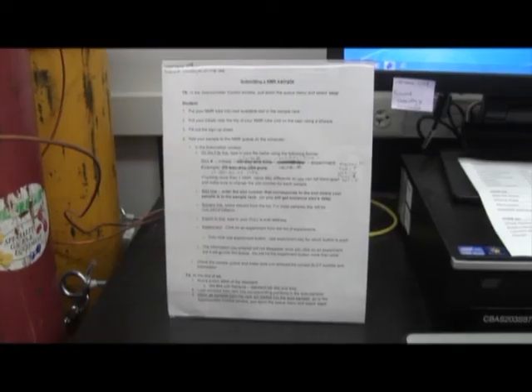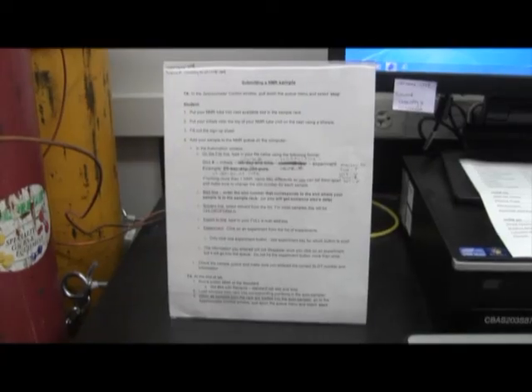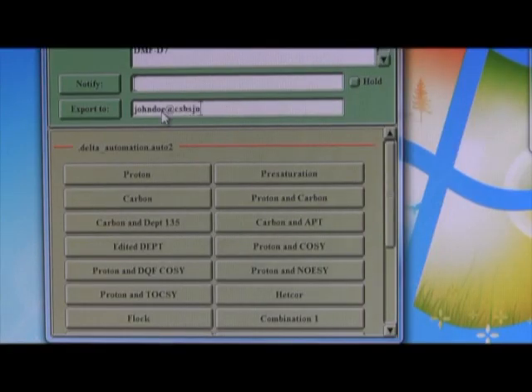Follow the directions by the computer to input your sample. Be sure to double check the slot number and the export to line before you submit.